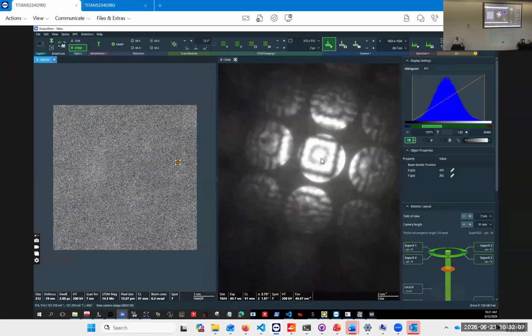If we try to do that, we have two different options. We can change the objective aperture itself and move that around. We can tilt it or we can tilt the sample. In this case, we already tilted the sample close to the zone axis, and we come to the question we had earlier. I thought you tilt the sample and not the beam.